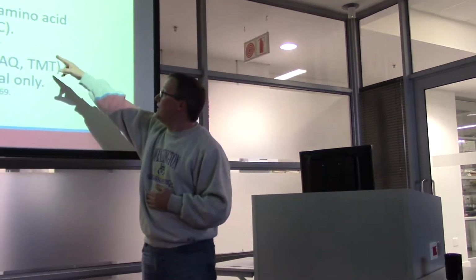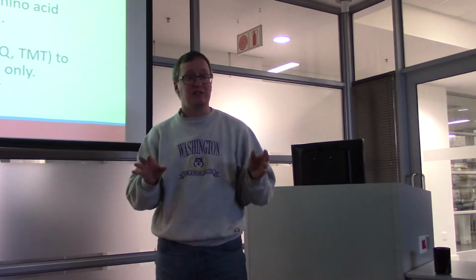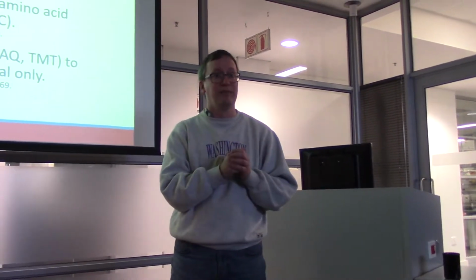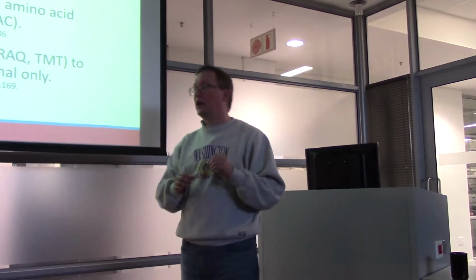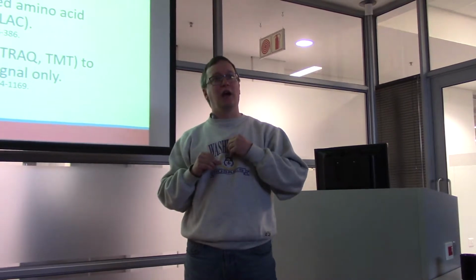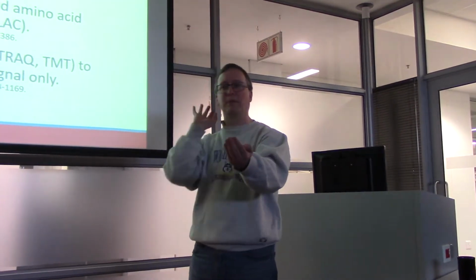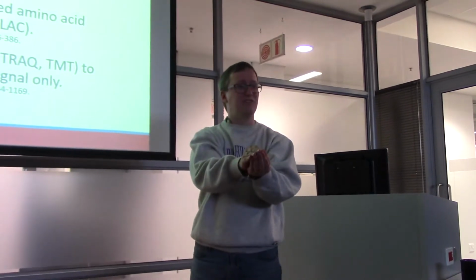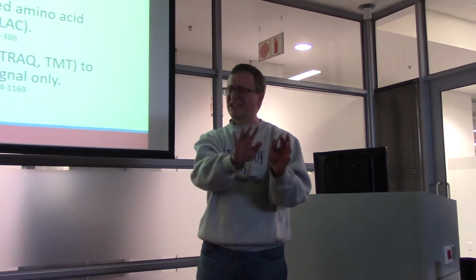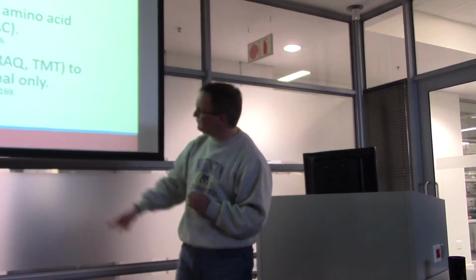So this incorporation of labeled amino acids is really good, even in mammalian systems, if you're working in cell culture. So you'll frequently see that will go on. Now the super SILAC thing was the argument that you can create labeled human proteins from SILAC and then compare unlabeled proteins from biological samples with that. There are a lot of problems with that approach, but you should be aware it exists.